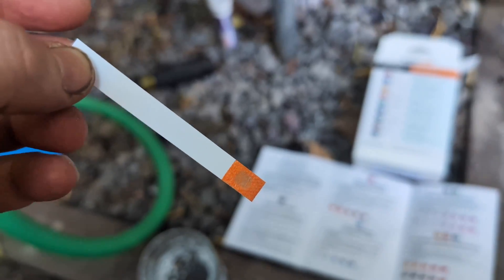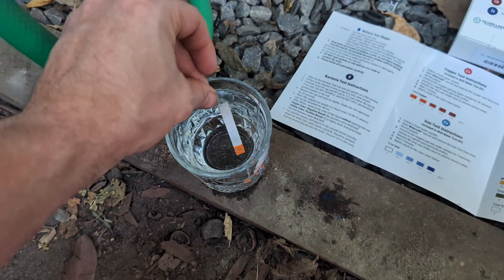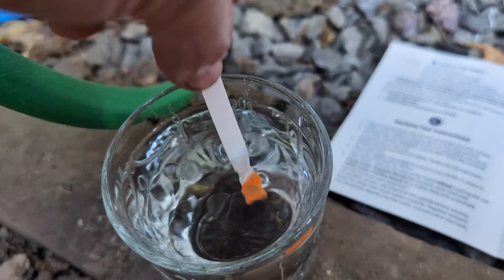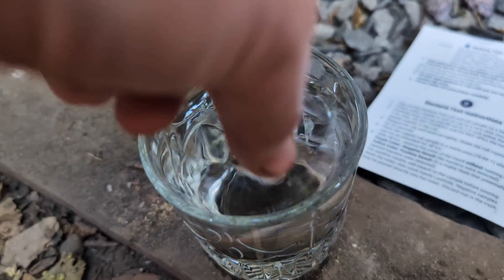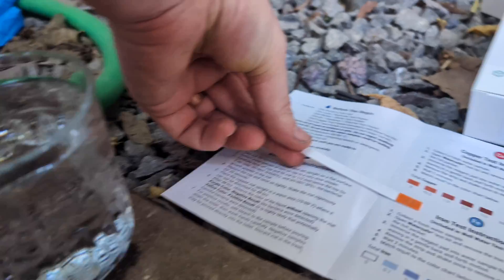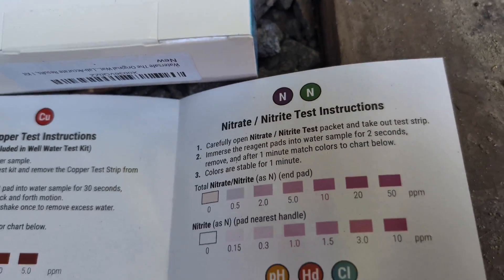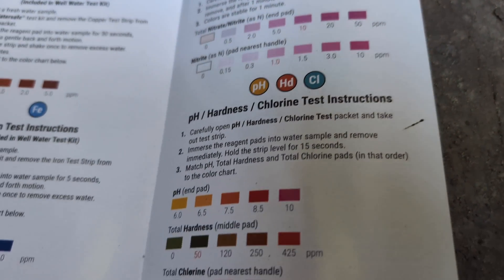Some of the other tests are like little strips. This is the copper test — it says immerse this in water for 30 seconds, waving it back and forth in the sample. How dark it is determines how much copper is in the water. Then we'll do iron, nitrate, and a pH, hardness, and chlorine test.